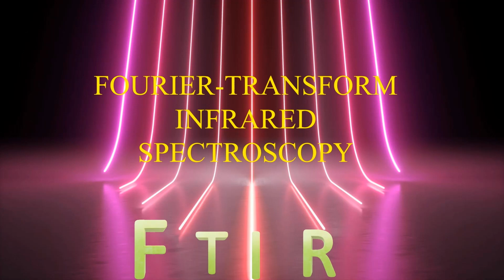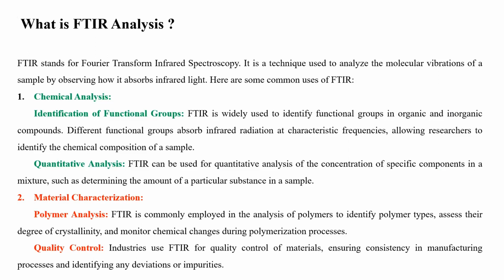Fourier transform infrared spectroscopy. What is FTIR analysis? FTIR stands for Fourier transform infrared spectroscopy. It is a technique used to analyze the molecular vibrations of a sample by observing how it absorbs infrared light. Here are some common uses of FTIR.